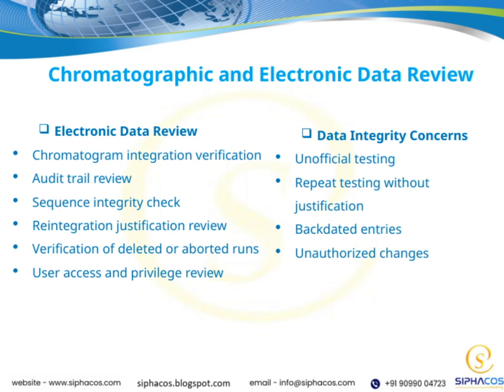Lastly, reviewing user access and privileges is vital. It ensures only authorized personnel can make changes, helping us prevent unauthorized modifications. All these points connect to our overall goal of maintaining high data integrity. It's about ensuring our data is trustworthy, compliant, and defensible at every step.